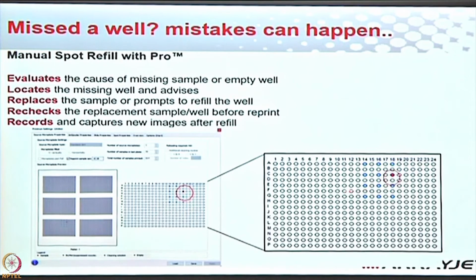So you can take the plate, have a look, and yes, it's missing. I've genuinely forgotten, which is fine. You put a buffer in, or you say, okay, it's not too late. If I missed it, I can put a sample in again. So you go to your lab, quickly prepare a sample, put it back in, put the plate inside the reader, and it starts where it has left off.